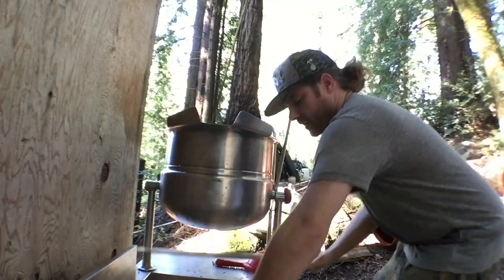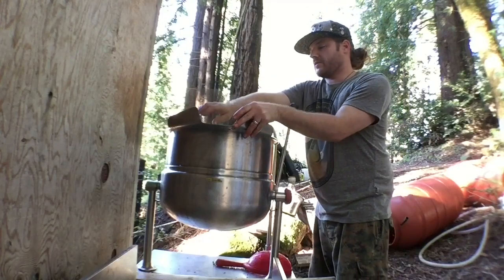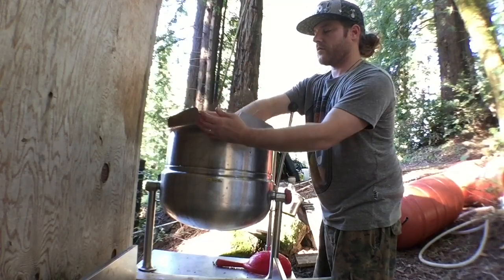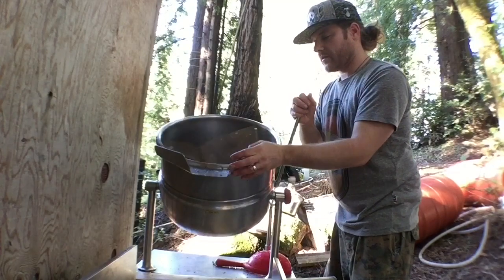We're just going to swish it around. And then I made this little screen. I just took a little piece of brass screen and put it right there to keep any kernels from falling out. So you just tilt them.